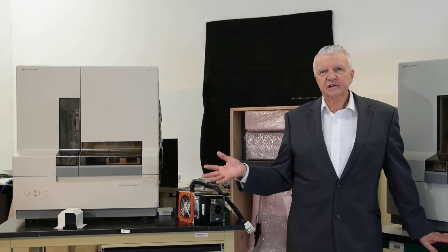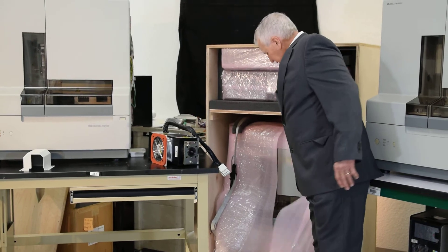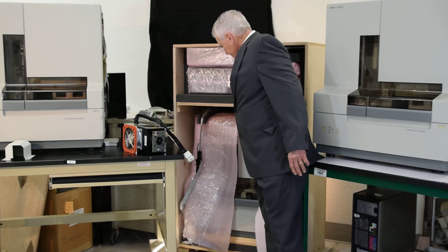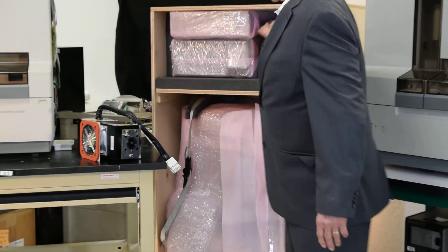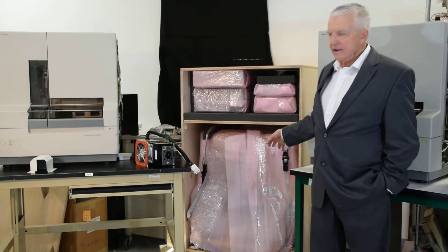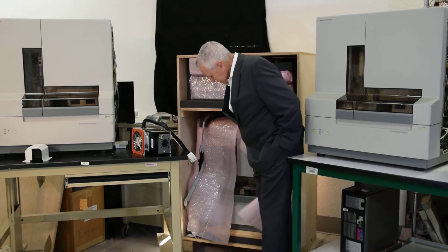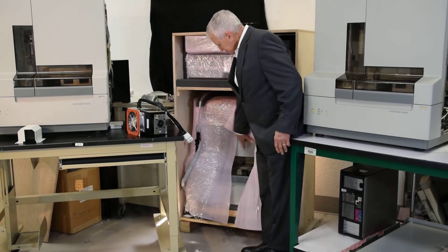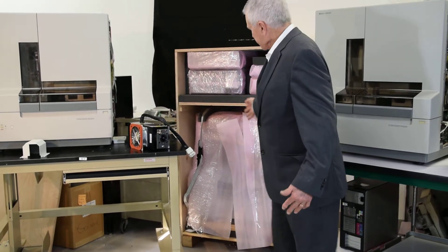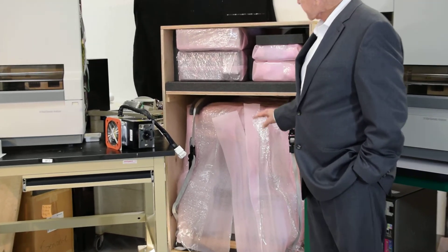Let me show you one more thing that's important to us. Here's a crate back here with another 3130 in it — this is a four-capillary instrument. We build these crates ourselves out of three-quarter-inch maple veneer plywood. The reason we do that is when we strap this in, we've got it on a floater base, and it's kept away from the sides of the crate by the strapping and the cleats on the bottom frame itself.